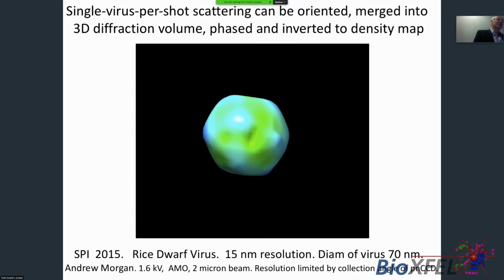This is very tricky stuff, and they're very sophisticated algorithms. And believe me, all that's been learned in cryo-EM is being applied to the algorithms on the single particle XFEL project, particularly by the Hajdu group in Uppsala. So this is the best that's been done, and it was important because it's got knobs on it. Previously, all our reconstructions had been blobology, and it was said of cryo-EM until a few years ago, it's a waste of time, it's all blobology. You always reconstruct things that look like blobs, and they have no new biology or information that's worthwhile.